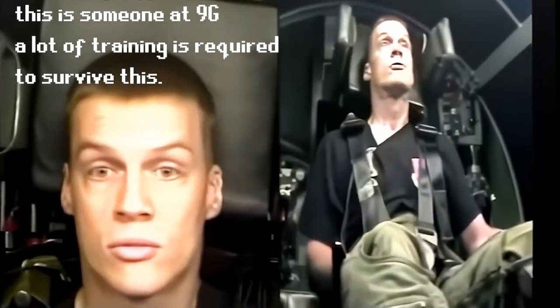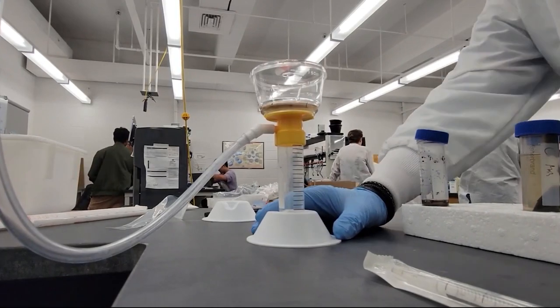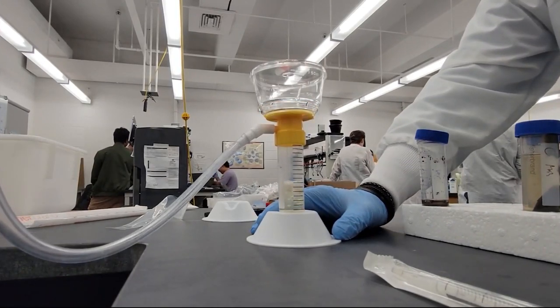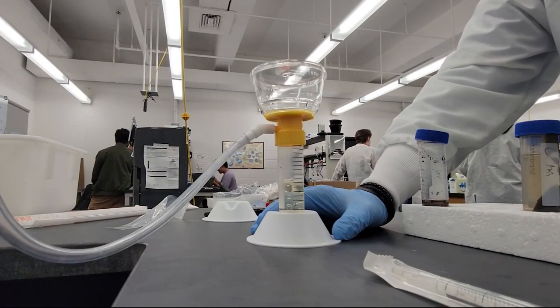We're gonna spin it at 1000 Gs. For reference, the average human can survive between 4 and 6 Gs. So these phage are really packing a punch. After it's done spinning, we've basically separated the gunk to the bottom, and we have this nice mixture of broth, phage, and bacteria, and hopefully nothing else, in the top. So we're then going to filter it out, make sure there's no particulates, and we have a relatively pure sample.